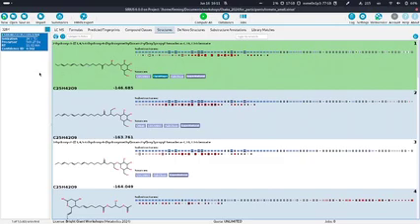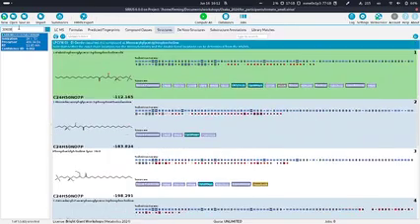Basically historically, I mean, the confidence score was introduced to tell you the likelihood that the structure annotation hit is correct. But what we found then was that quite often we have candidate lists where the top 3 candidates were just indistinguishable. Like there's only one OH group moving in a ring at some position, and it's probably even impossible with mass spec to distinguish them. Like they would have the same MS spectrum. But still, if we know that one of them is correct, that's also a lot of information.